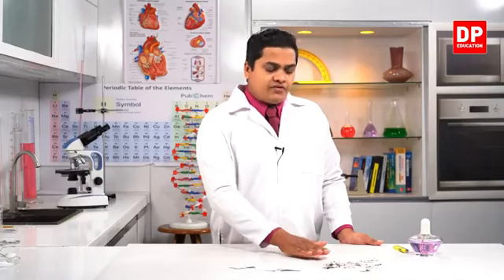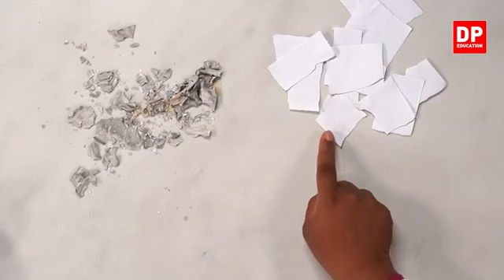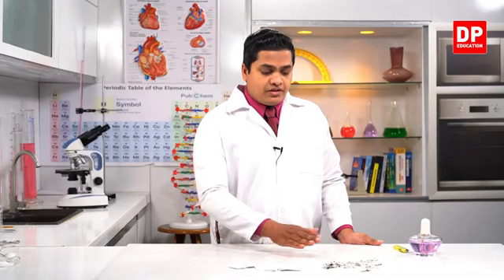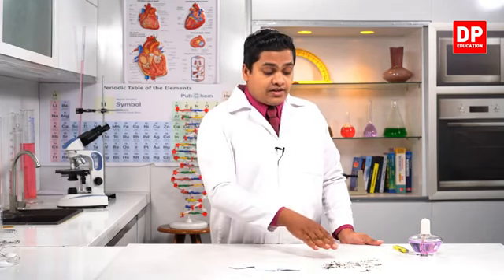The composition of these substances is not the same as the paper in the first instance. You can clearly observe even the color has changed dramatically. Now, if you were asked to write certain things on these ashes, can you write it? Of course, you can't.